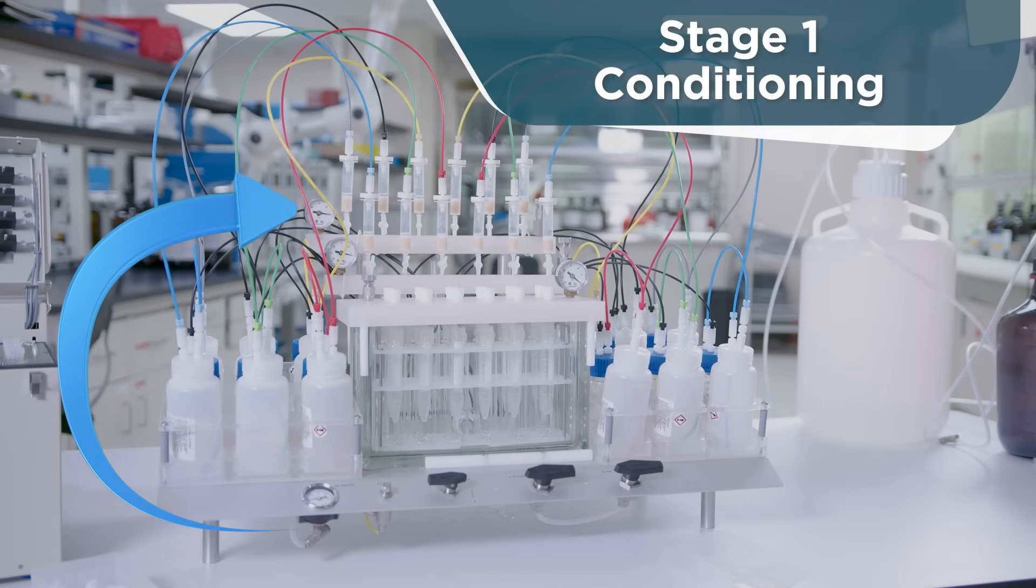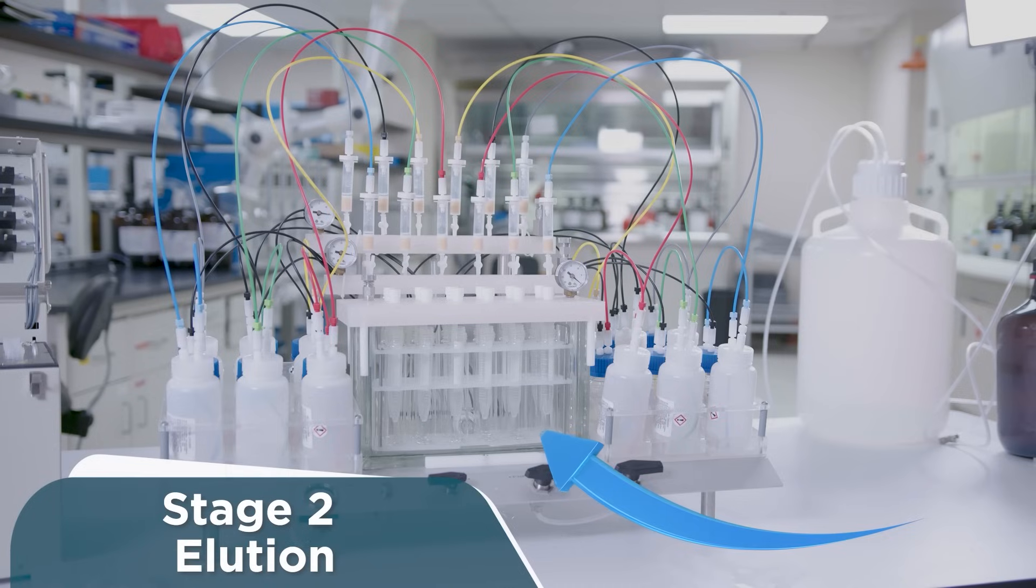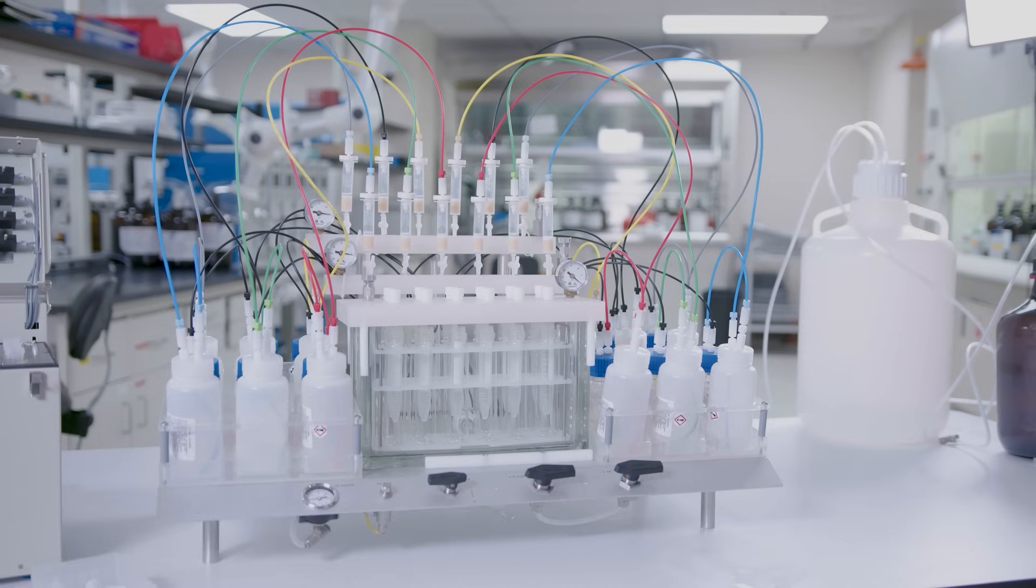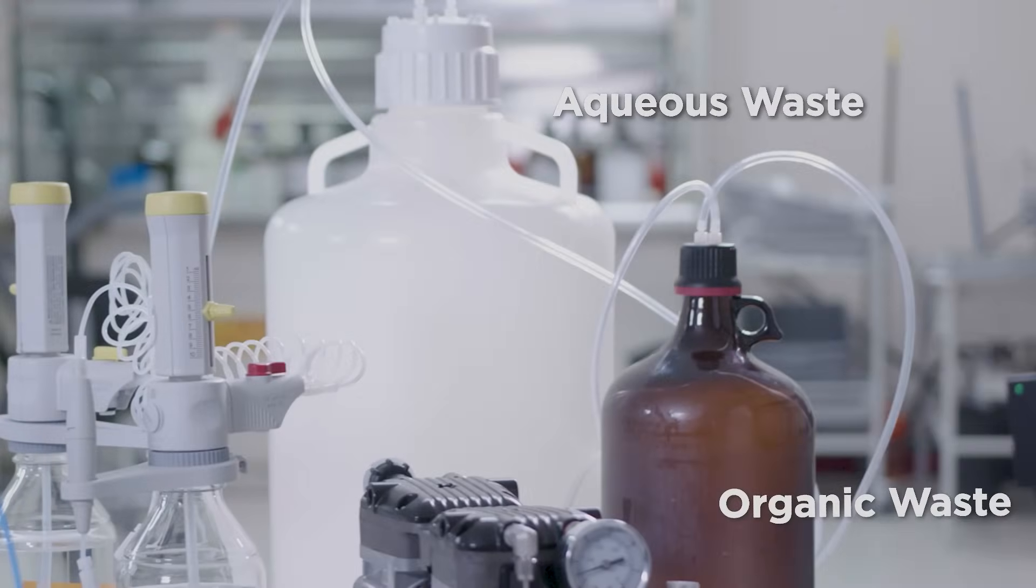Dedicated manifold for cartridge conditioning and sample loading. Dedicated manifold for extraction and extracts. Separates organics from aqueous waste.